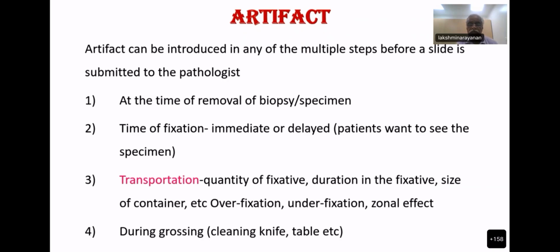At the time of removal of biopsy, and that Dr. Mahajan has covered very well, and time of fixation, that is whether it is fixed immediately or delayed. Here I want to give a little explanation on this delayed one. When you look at the specimens we receive in a hospital, definitely from theatre we expect, or sometimes from many laboratories for second opinion, or they send the tissue to some other places. In nursing homes or where the surgery is done, the surgeon wants to show the specimen to the relatives. So the surgeon removes the tissue, then he completes his surgery, and then he shows the specimen to the patients, and then everyone takes a WhatsApp photo or other photos they want to send, and then it is taken for fixation. So how much delay really has happened there? Nobody has bothered to see how much delay has happened.